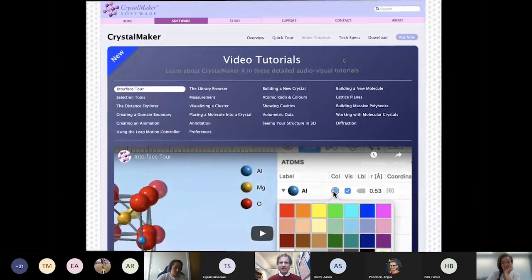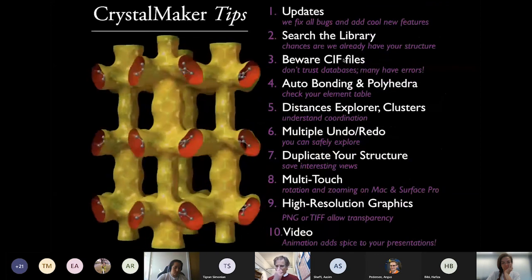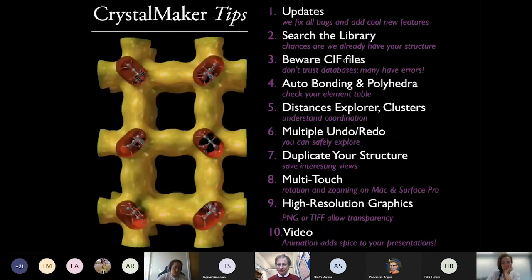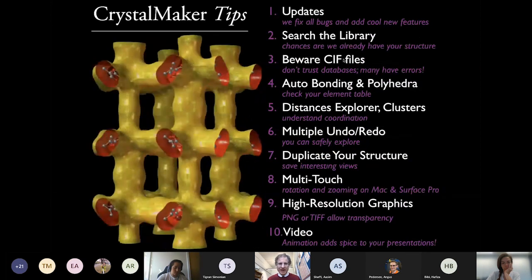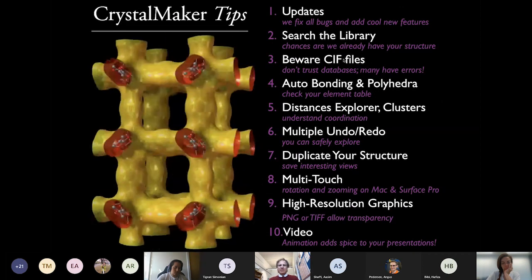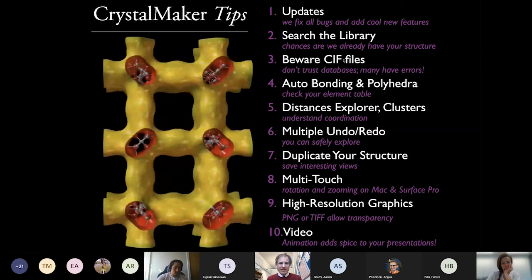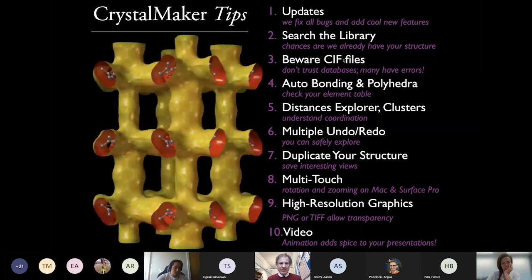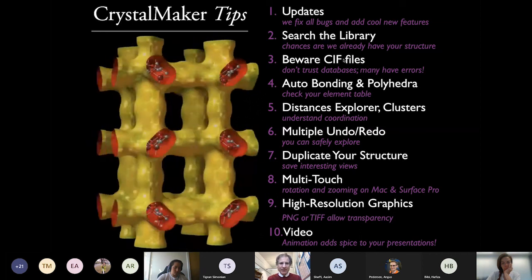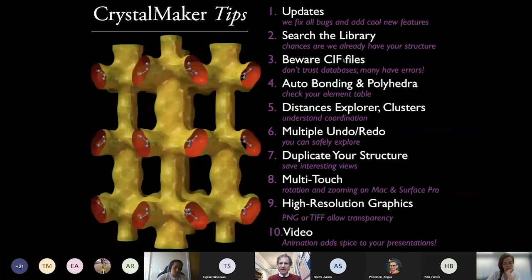These are the video tutorials. A few quick tips. We do fix all known bugs. We have updates available from our website. You've seen the library. Be a bit skeptical of any files that you get from online databases. Many CIF files in particular are very fragile, and if edited, they can cause problems.